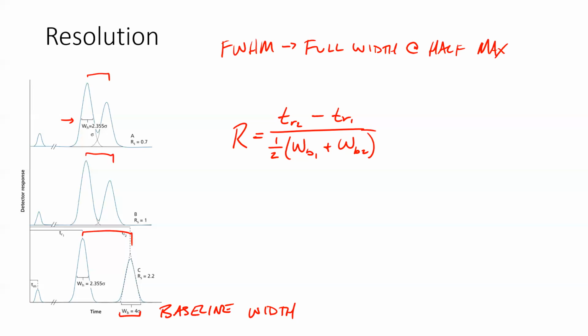In a separation like this, the reason that we try to get good resolution, right? Not only do we want to tell what all our peaks are, but remember that the whole point of chromatography is that it's not an analytical method, right? It's a separation method. And in order to get these compounds isolated enough that we're sure that we're getting all of that particular compound and not any mixture, right?